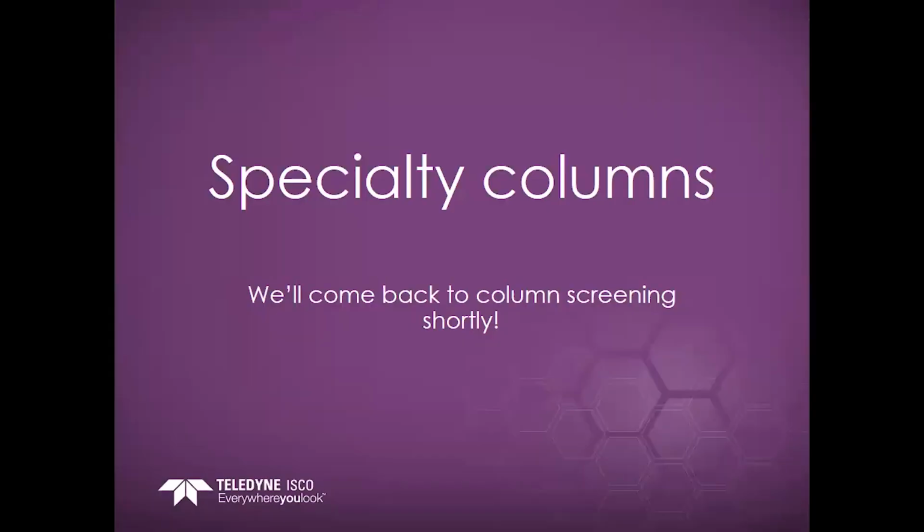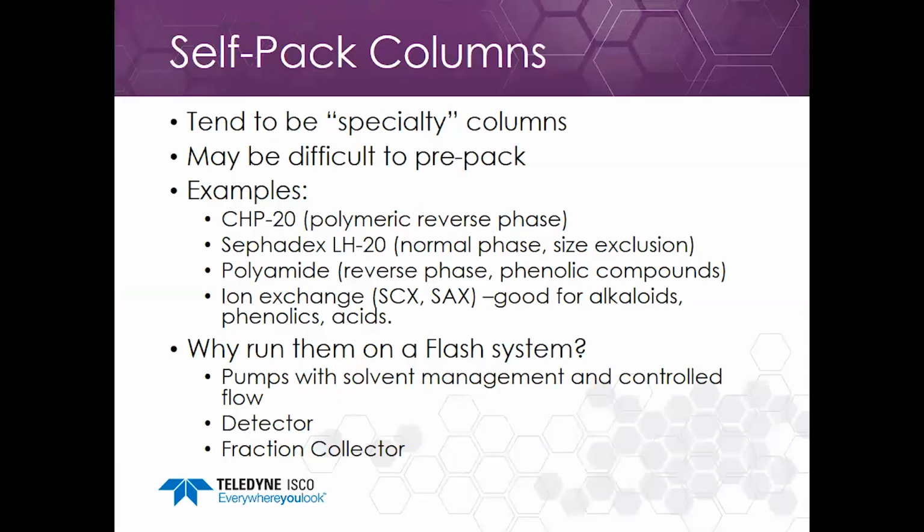We're going to talk about some specialty columns, and then we will come back to column screening. Capsaicins only have a single hydroxyl group, and so they don't work very well on ion exchange. Self-pack columns tend to be specialty columns. They might be difficult to pre-pack.